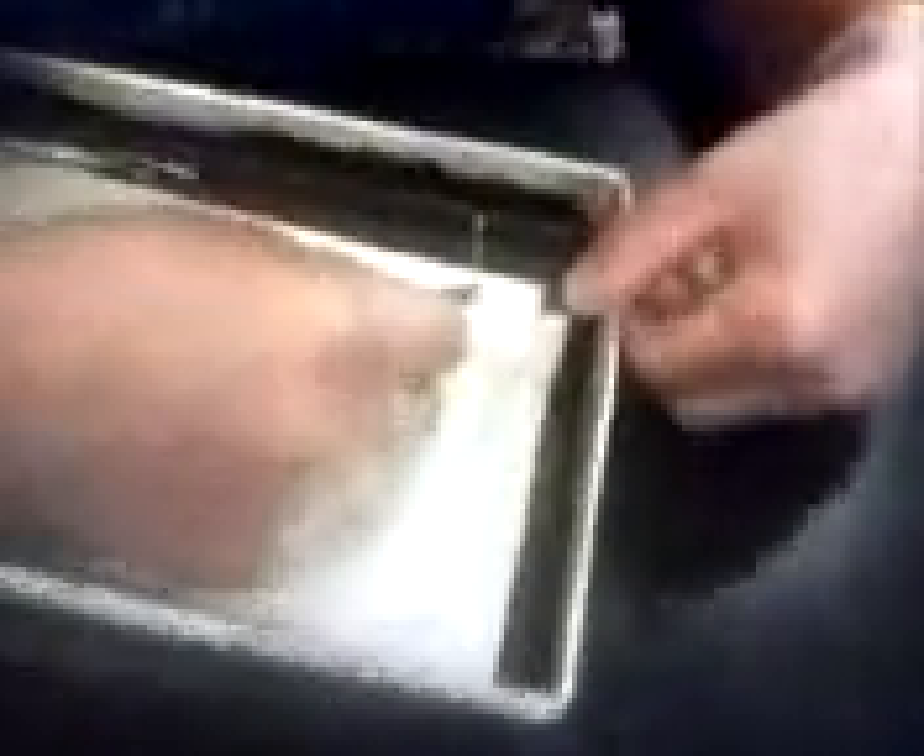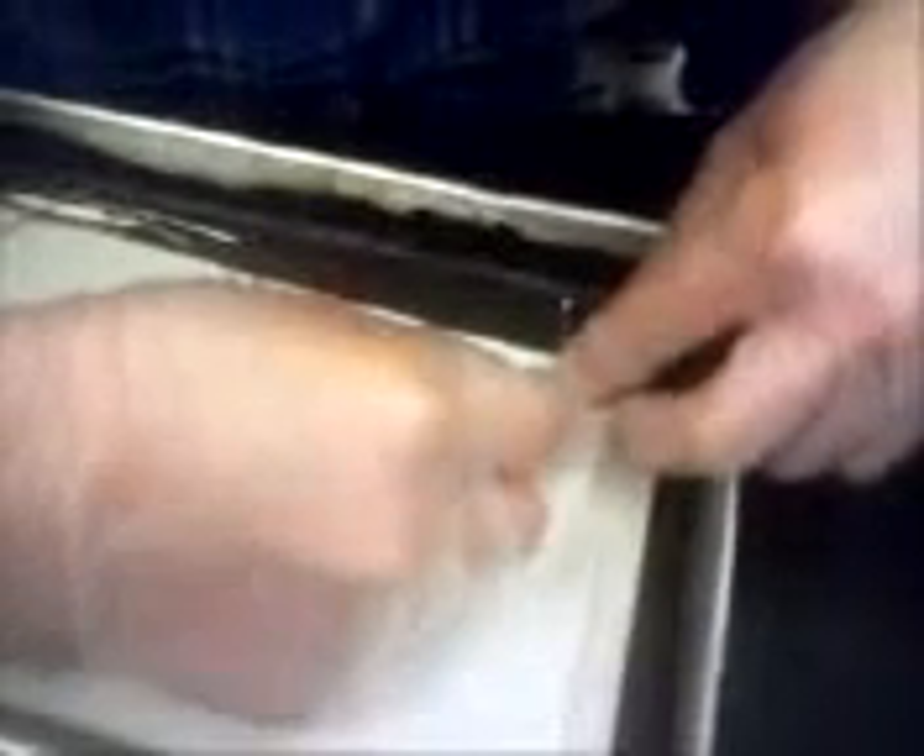Where do we make the incision? The incision is to the side. Eww, it feels nasty. Right here? How long and where do I start? Start right here at the top and end right around there. It has to be kind of shallow.